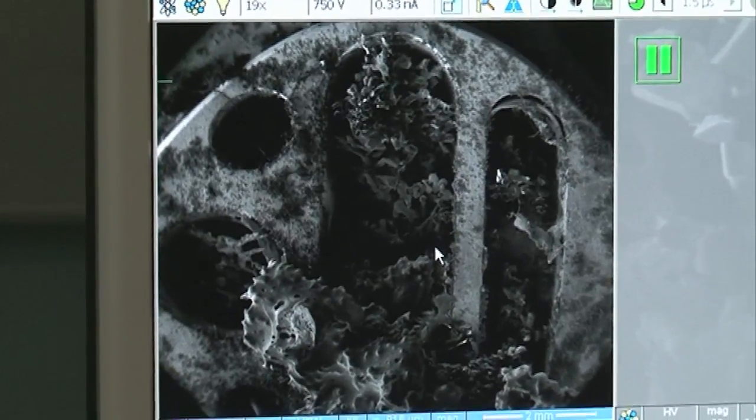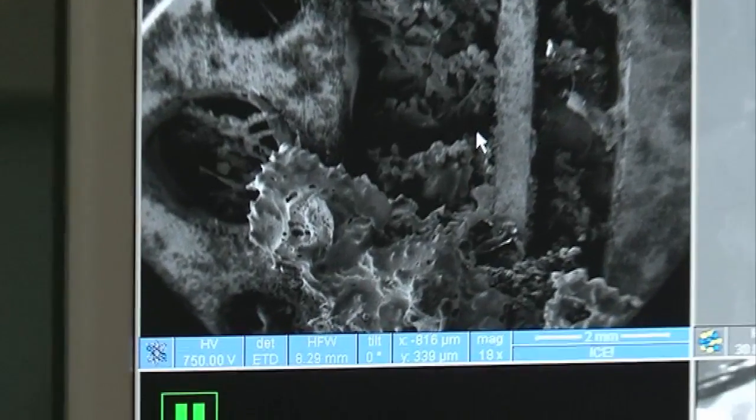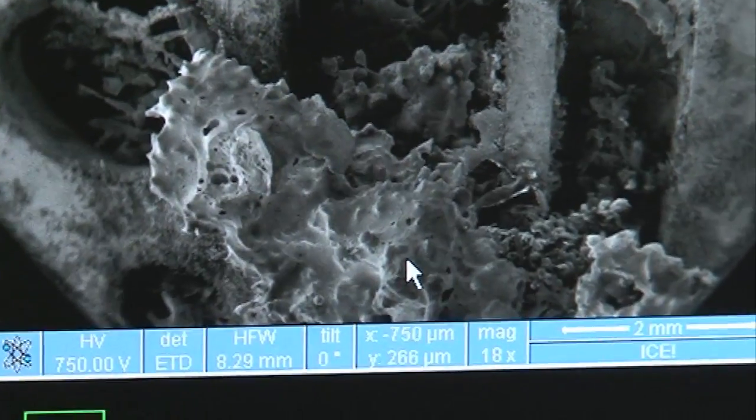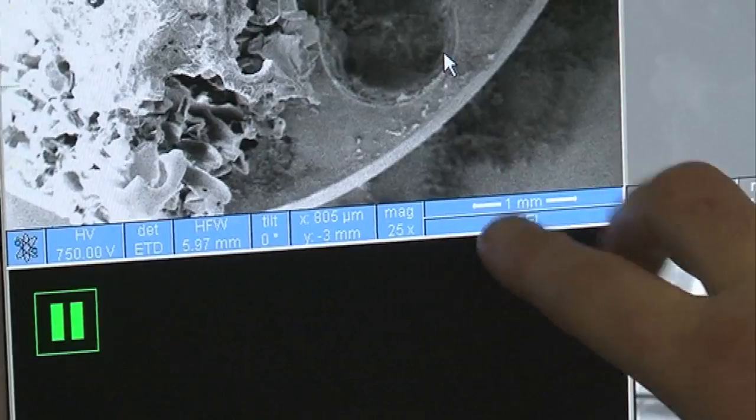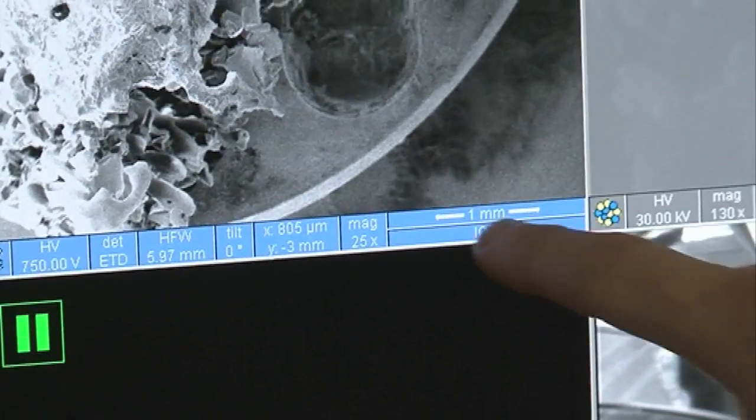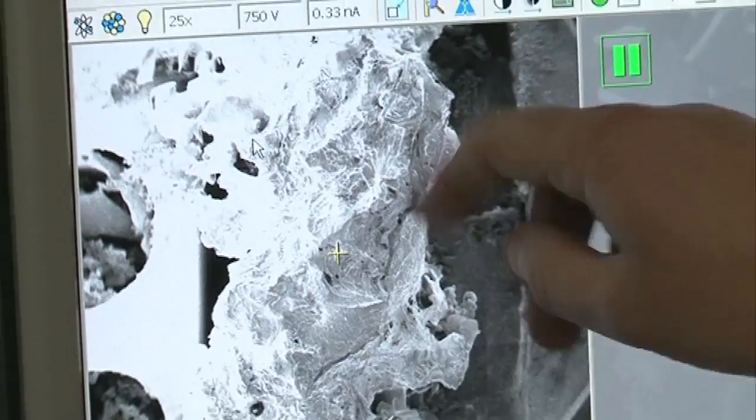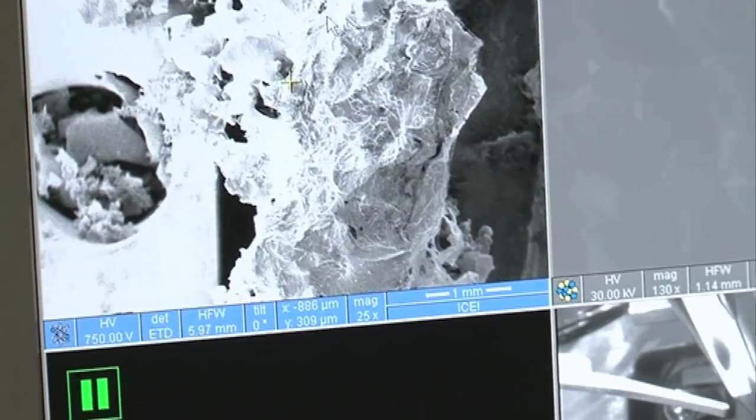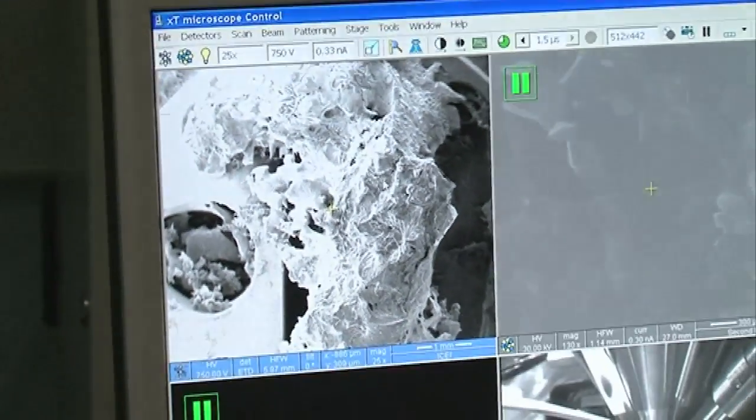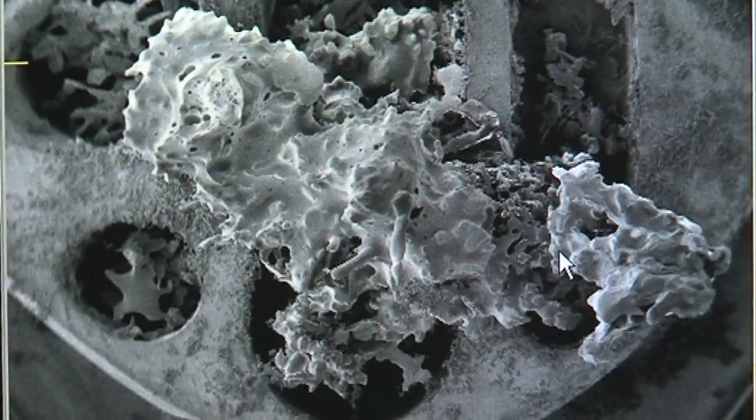What Chris is doing here is progressively zooming in to look at the structure of this snow sample that he's put in here. This particular bar is at the moment, you can see it keeps changing, it's a millimeter across. So that gives you an idea of the scale that we've got here. Now Chris is going to keep moving in, zooming in, zooming in, looking for interesting regions.